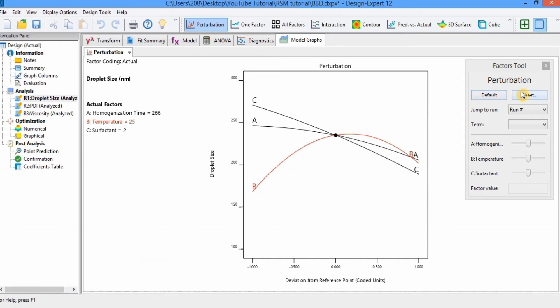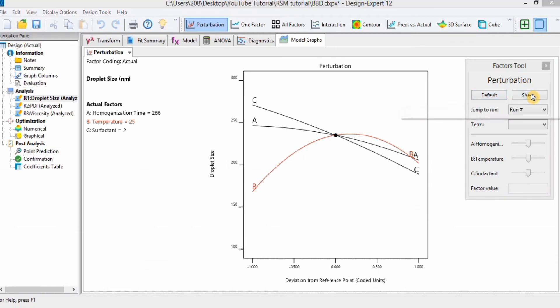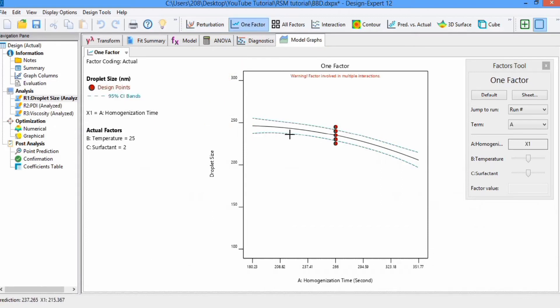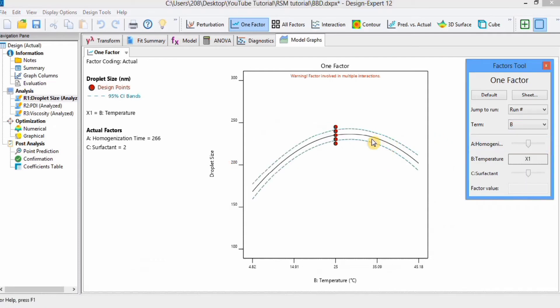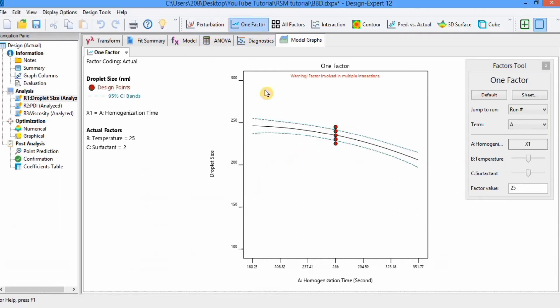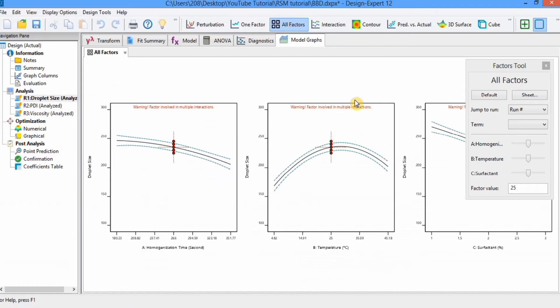Here you will find the sheet in factor tool option. Click on sheet and you can see the factor values — you can even change them using this option. Next we move to the one factor graph, which shows each factor one by one. Currently it shows factor A's effect on droplet size; you can change to factor B to see its effect. If you want all factor responses shown on one window, click on all factor and all graphs appear.